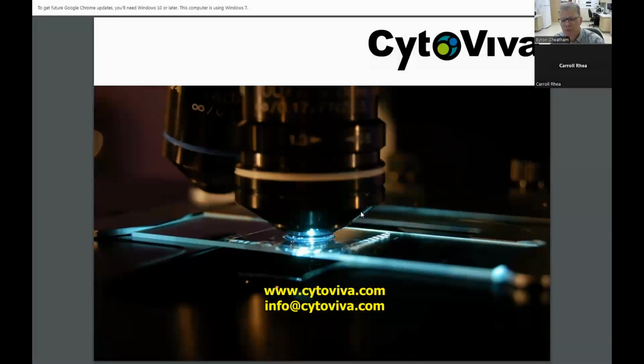If we think about something like polyethylene glycol, PEG, with a sufficient molar weight, we've even had groups that are able to look at different molar weights of PEG around the nanoparticle. That biocorona is shifting the optical spectrum of the nanoparticle, and they can even see different molar weights of PEG that produce different optical spectra that can be measured.